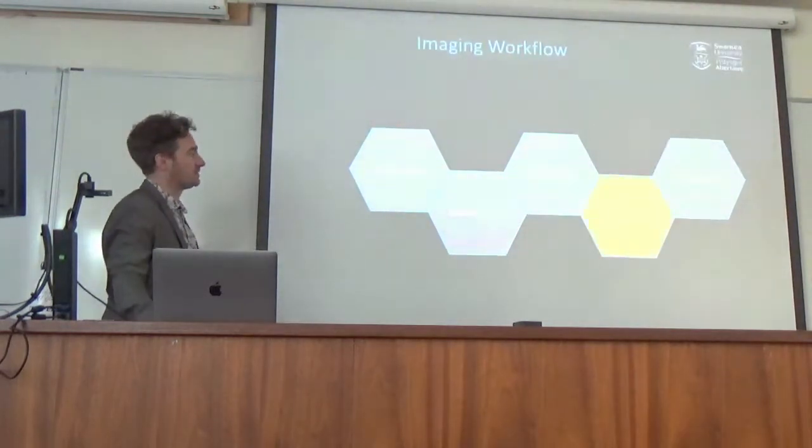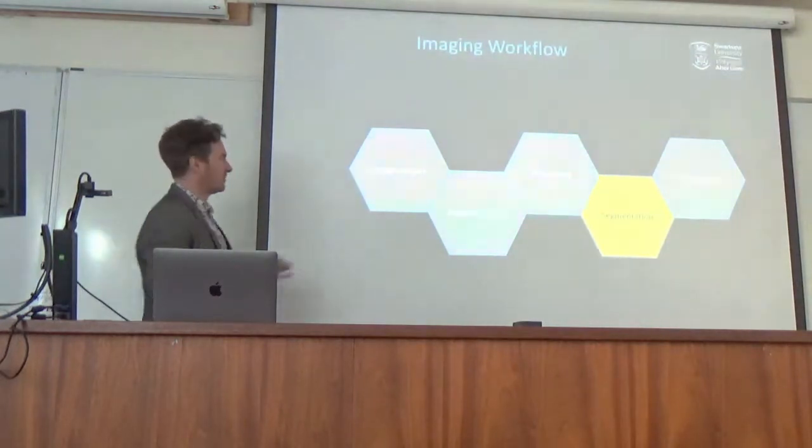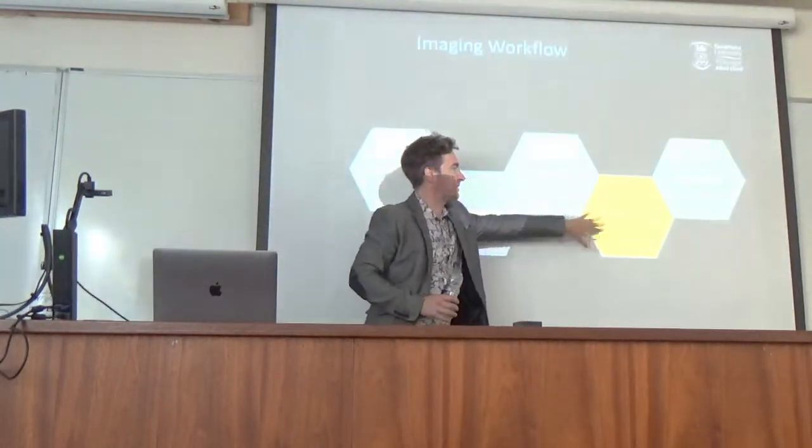Sometimes the visualization is of the volumetric, or sometimes it's creating this secondary output that's surface files for outreach. So that's the bit where I think there's huge potential for us as a field to change. There's lots of people doing stuff in here. There are loads of people doing stuff in here as well.